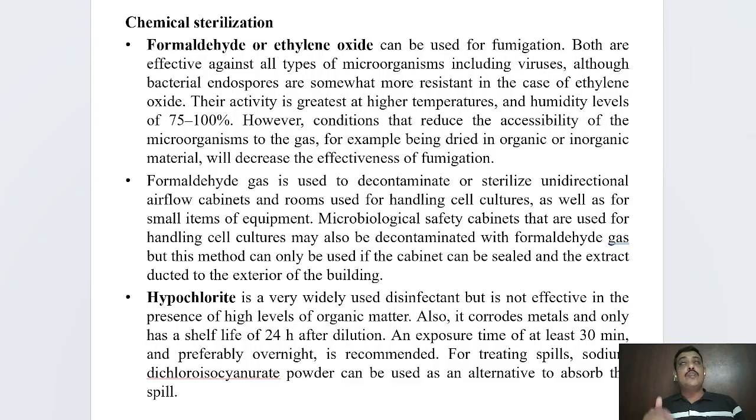And as I told you, it is usually created as a gas. Okay, so formaldehyde gas will be produced, and this gas will circulate through the entire cell culture room during a 12 hour or 18 hour incubation time. Until then, the gas will circulate through the entire room, and it will kill the microorganisms present in the environment. So this is one of the chemicals that we'll be using.